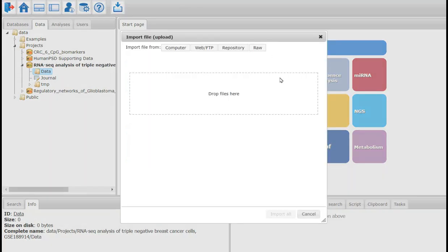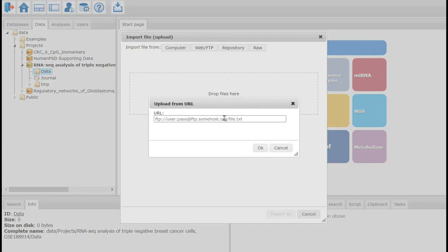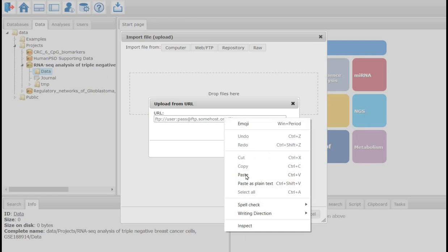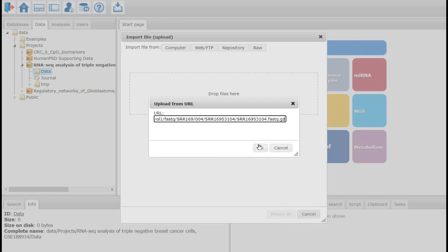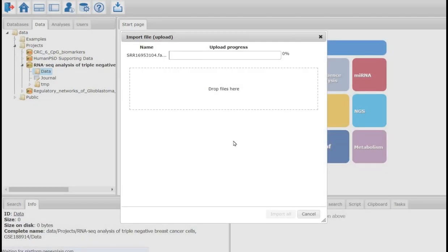In the new import dialog box which is opened, I click on the tab Web FTP and paste my FTP link and press OK. The upload starts. Since FASTAQ files are big files, it takes a couple of minutes for the upload to complete.